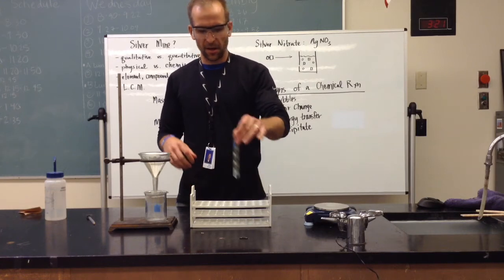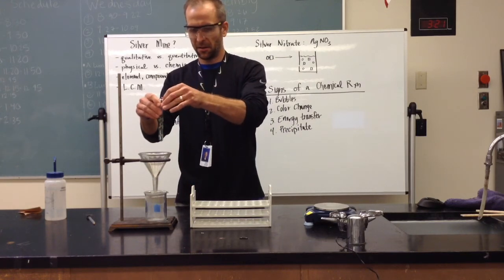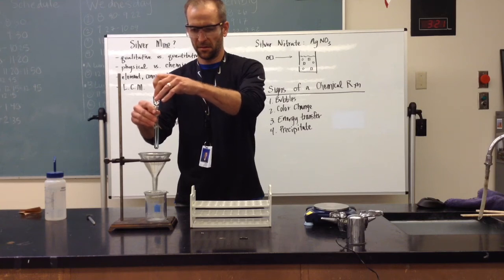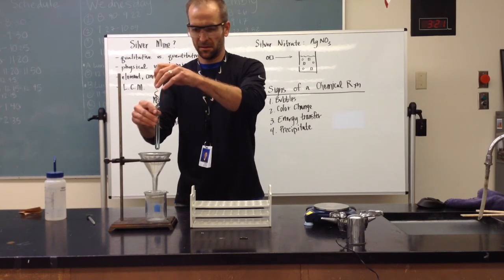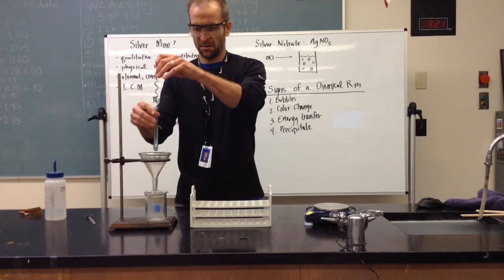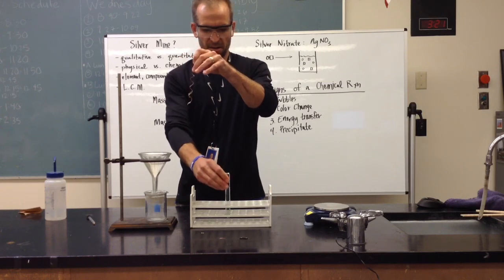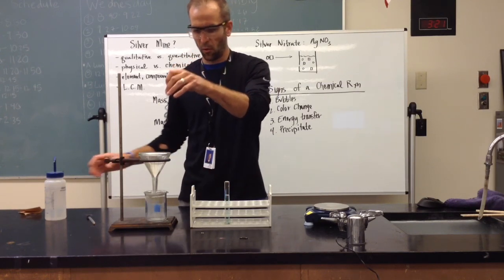I'm going to take my copper wire out. As you can see, a lot of the precipitate stayed in there. You can see that blue color even more now.